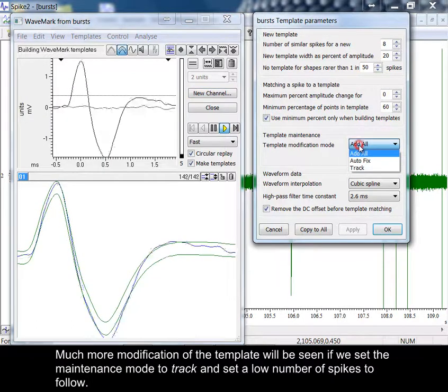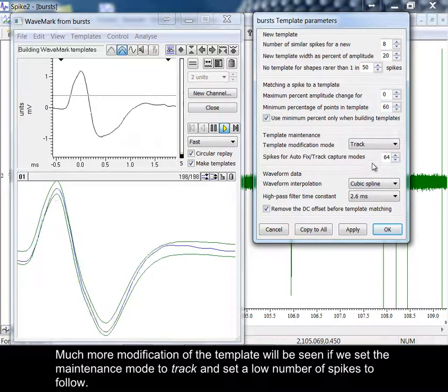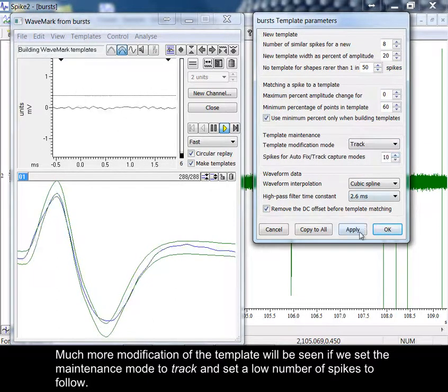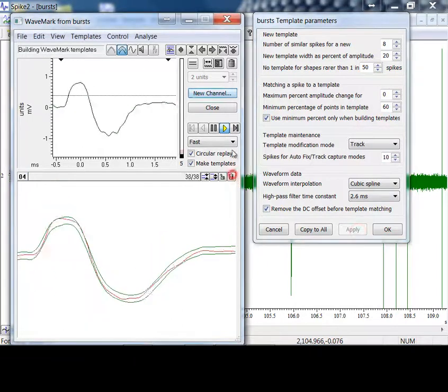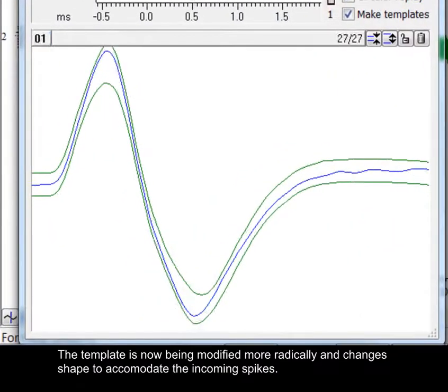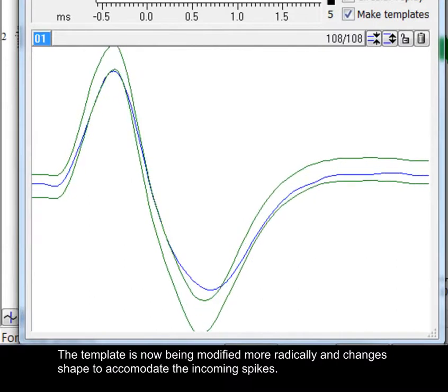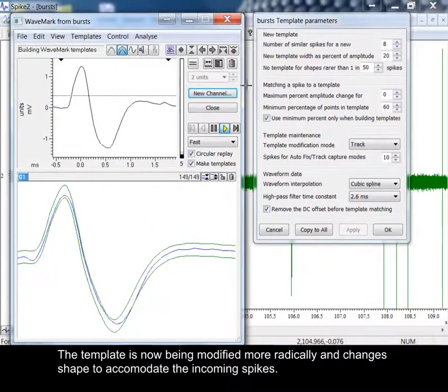Much more modification of the template will be seen if we set the maintenance mode to track and set a low number of spikes to follow. The template is now being modified more radically and changes shape to accommodate the incoming spikes.